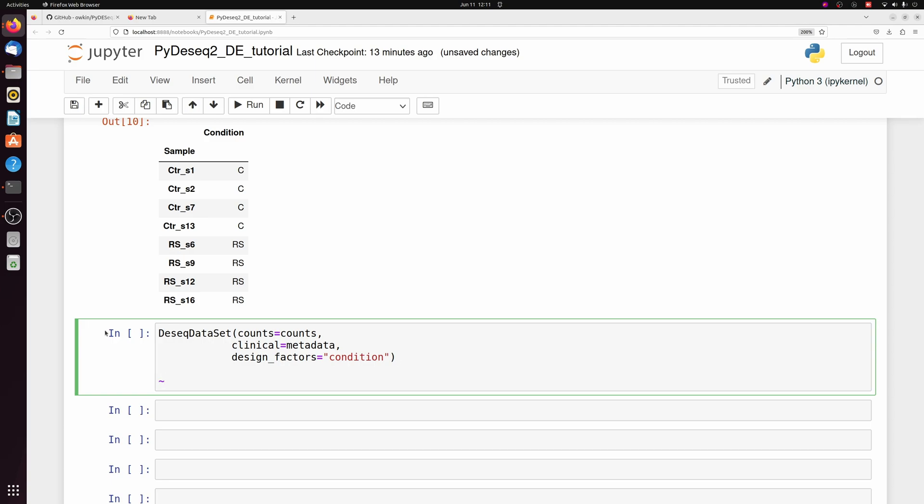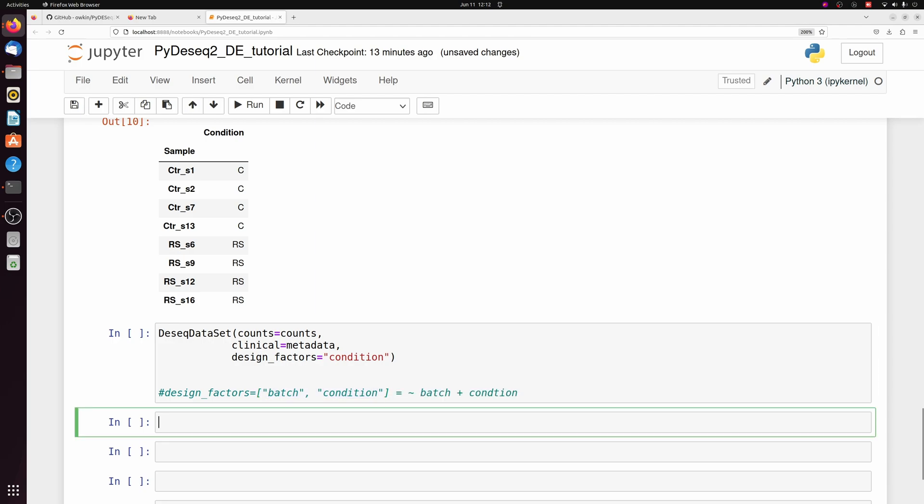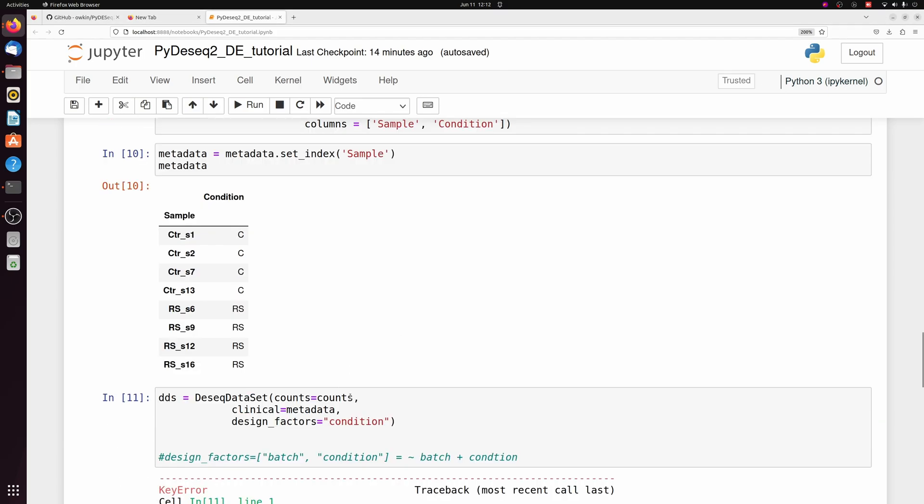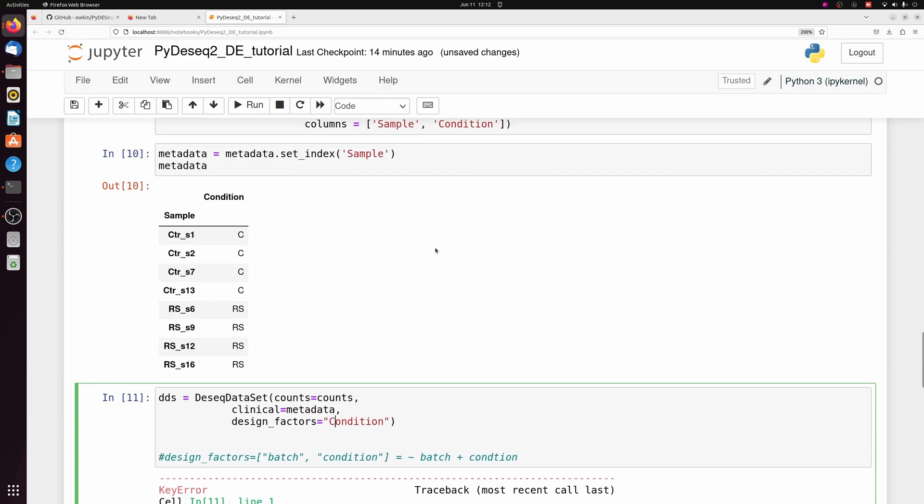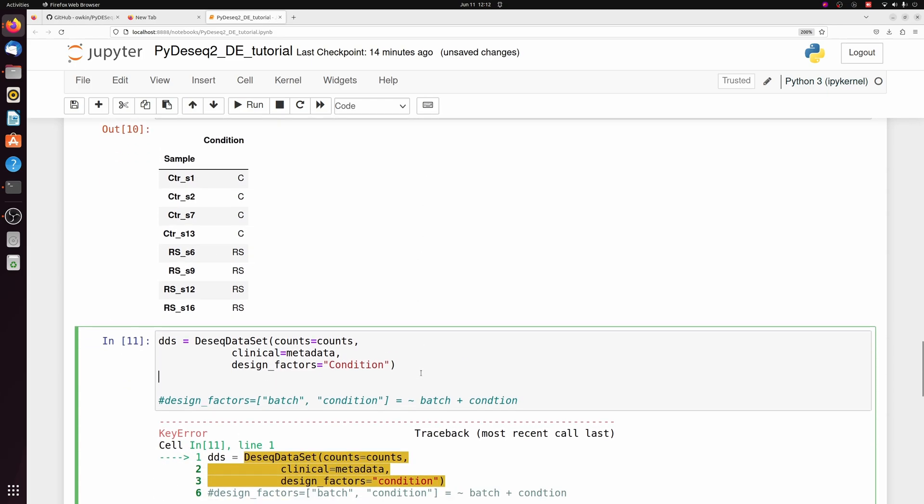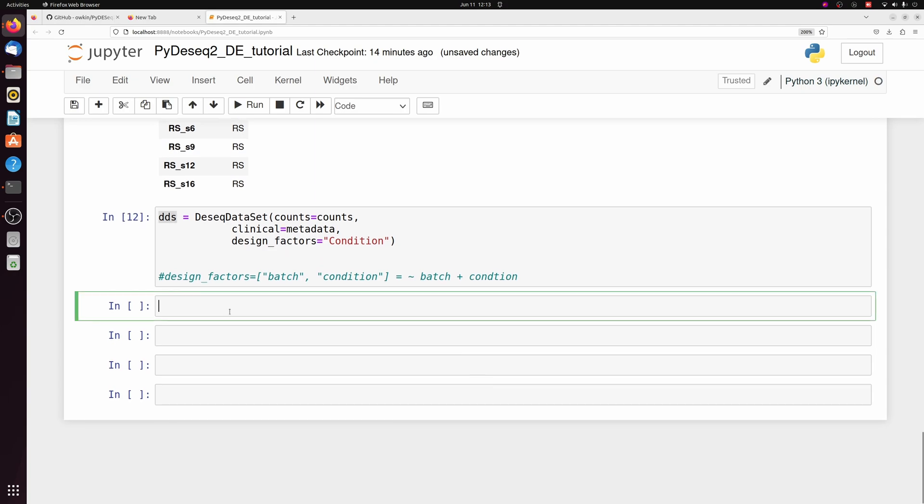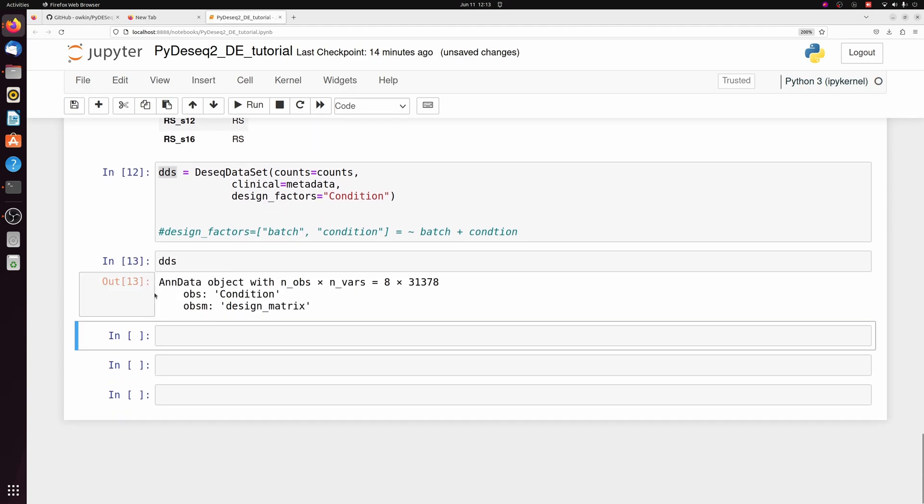So we're specifying condition. So this is a little different than dseq2 in R. In dseq2, you do something like condition plus batch as one string. But here, let's say if you had a batch, you would actually have to supply a list. So instead of doing that plus and the little tilde sign, you just put a list of your conditions here. And that's the same thing. But anyways, we're just going to save this as DDS now. So we have our DDS object now.